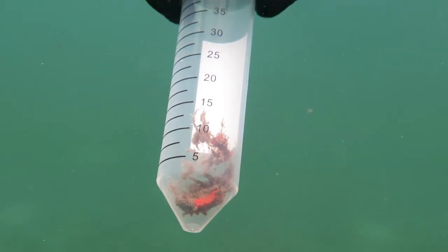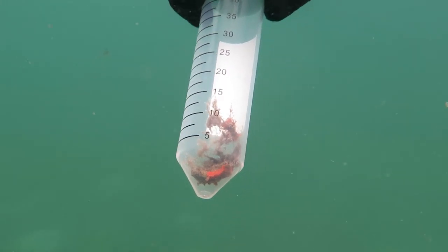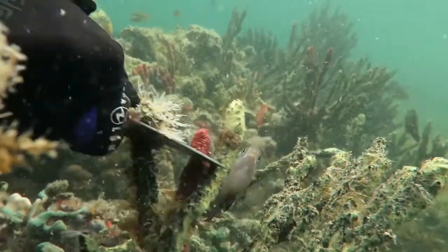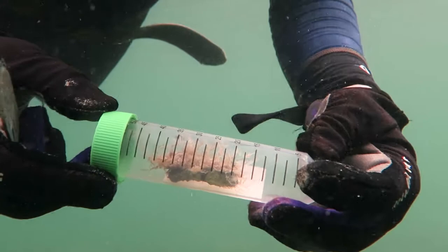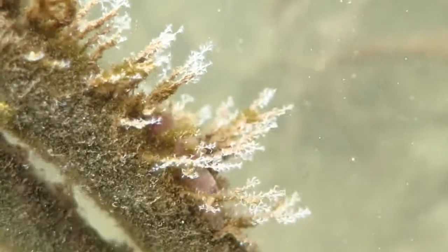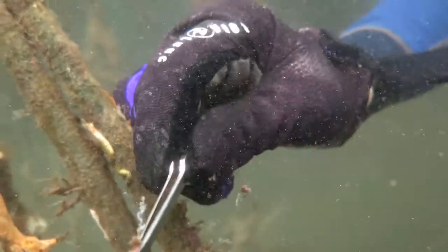You will need to inspect the substrate under a stereoscope once you are in the lab. If you spot a big colony, collect it with a little bit of its substrate and put it in a falcon tube or a ziplock bag. You can prepare multiple labeled bags or tubes if you're planning to collect hydroids at different depths.